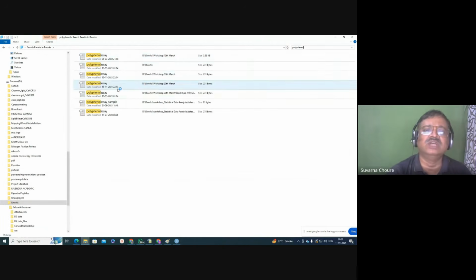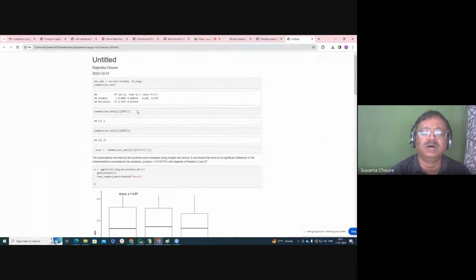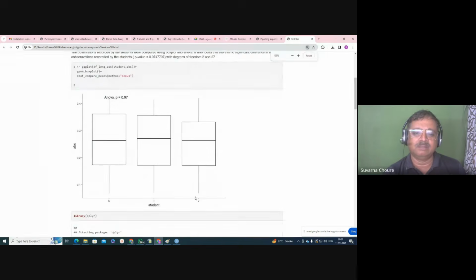Here, my students actually did replicate measurement of tannin assay, polyphenol assay, to measure tannin content of food. And 3 students performed the experiment, Bhagyashree, Tanvi and Vaishnavi. And their readings are almost similar. No statistically significant difference is there.